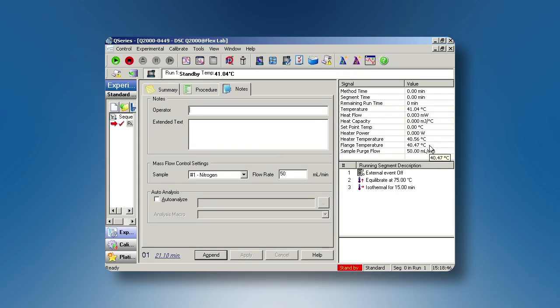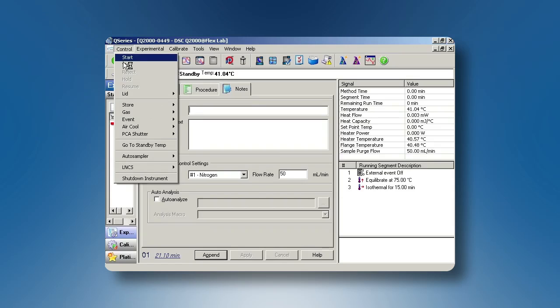You can note that the sample purge flow is set at 50 ml per minute of nitrogen gas. The flange temperature as well as the cell temperature are both above ambient. To turn on the RCS, select control event on.